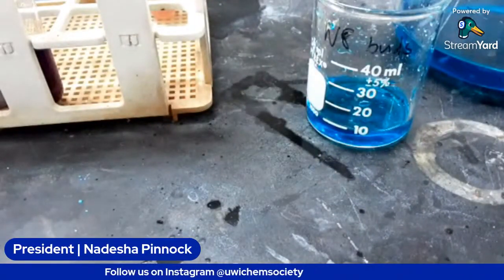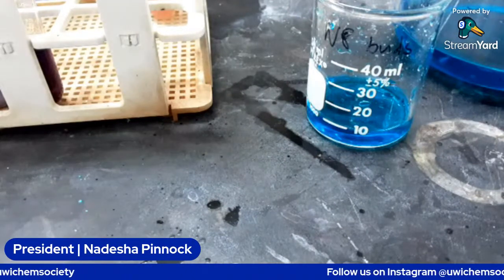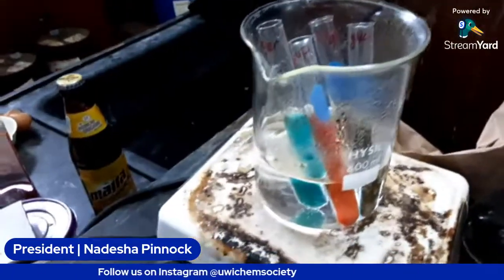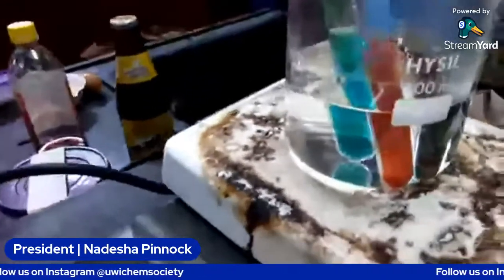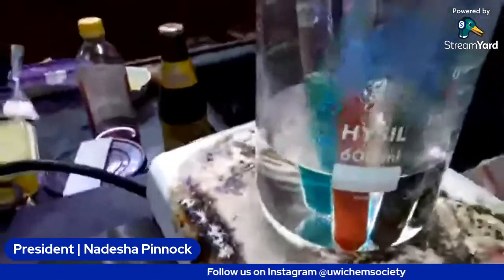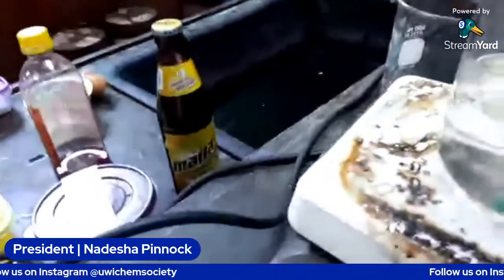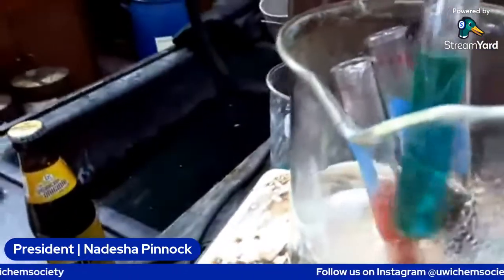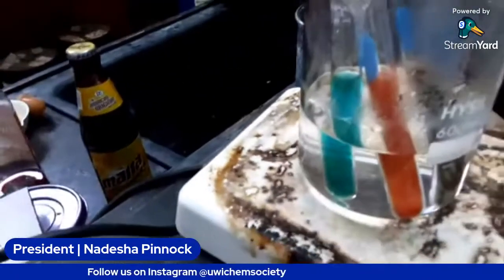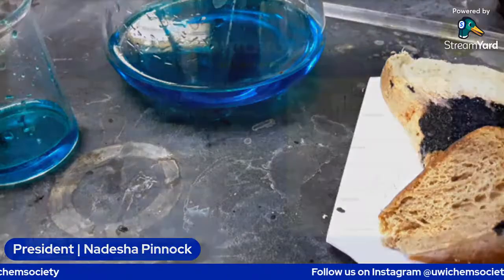All right, so let's go to the theory for lipid emulsion real quick, and then we can get to do the test. Meanwhile, this is ongoing. As you can see, some of them have already changed color. This one is orange. That looks brownish. This one looks kind of blue-green looking.